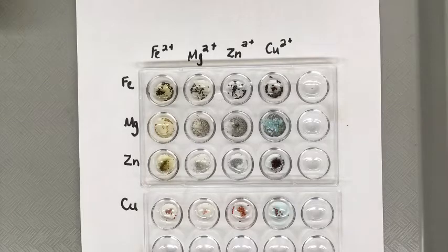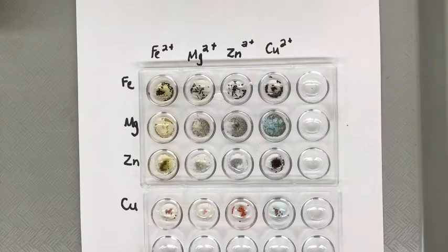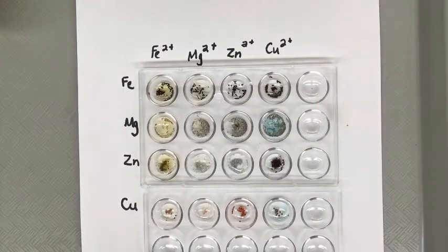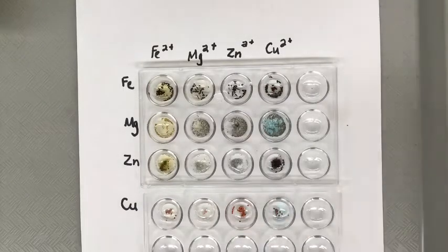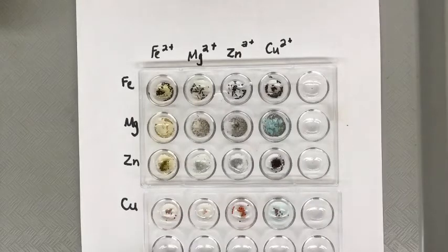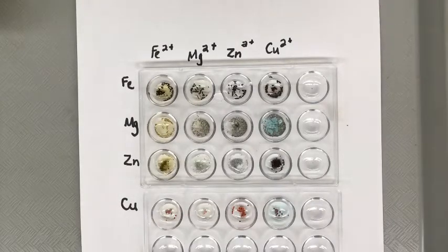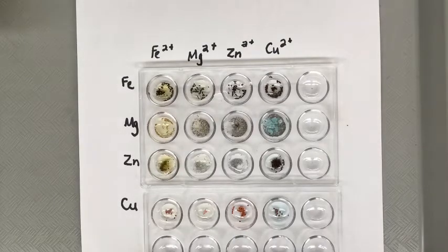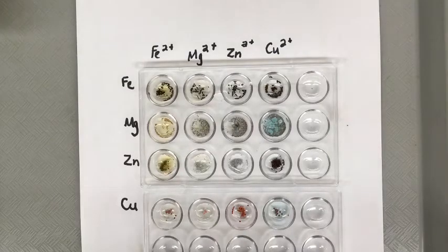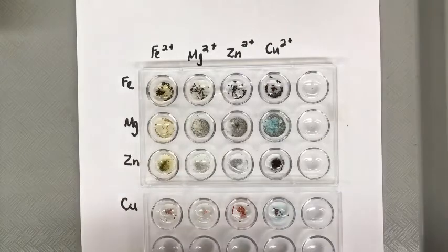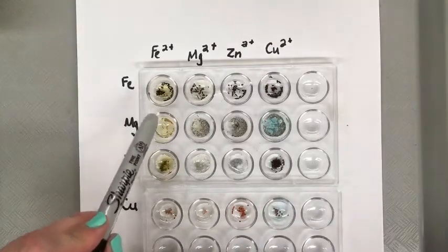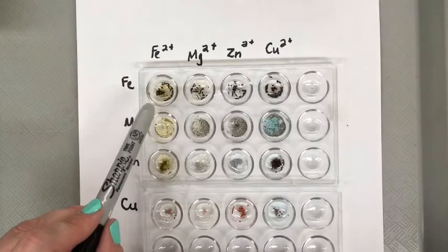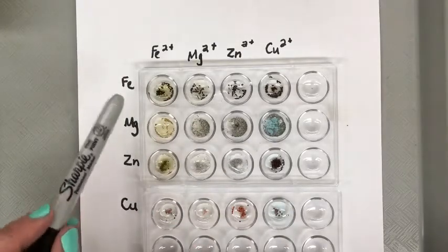In the first column going across iron, we're going to set up the grid just like this and put check marks or X's if there's been a reaction. If we look across iron, there hasn't been a change in this one. There's no color change, no bubbles. It seems the same as before.